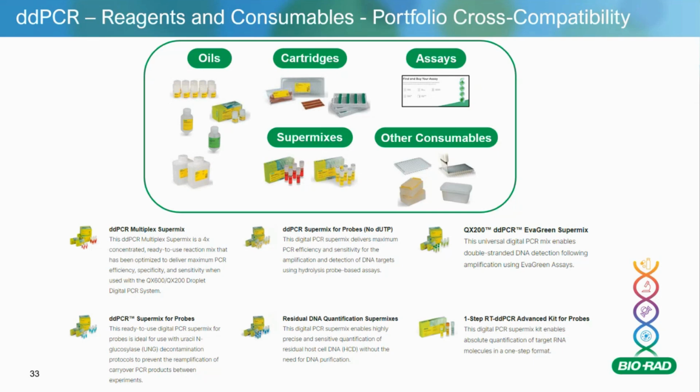So in so doing, ddPCR really is a really good tool for outbreak surveillance, as we can see, being successfully used in wastewater-based epidemiology, but also in pathogen monitoring for hard to detect or limited quantities. Really a great tool for outbreak and pathogen monitoring as well.